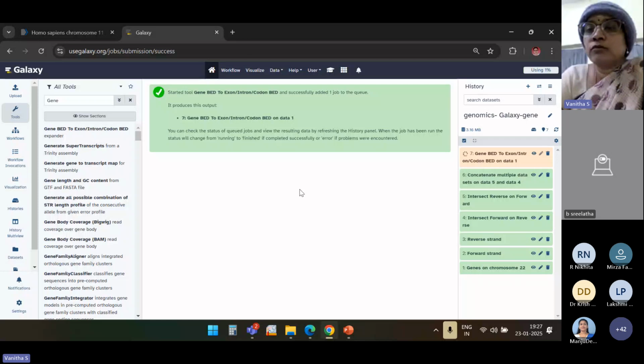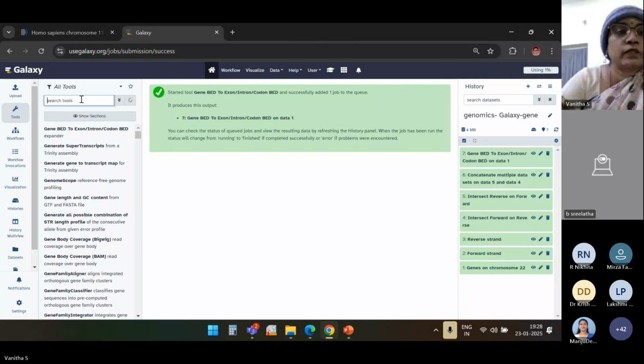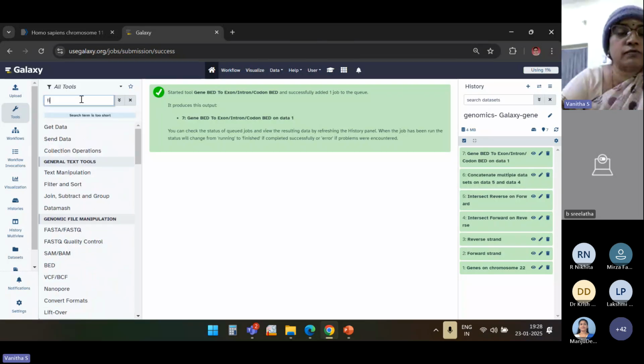Okay. So now it is running. Now what we are supposed to do is, from the whole gene, you are now concise to get only the sequence, only the exons, you are now getting it out. Okay. So now from these exons, what you're going to do now? What's the next thing you're going to do? You're going to repeat the process.